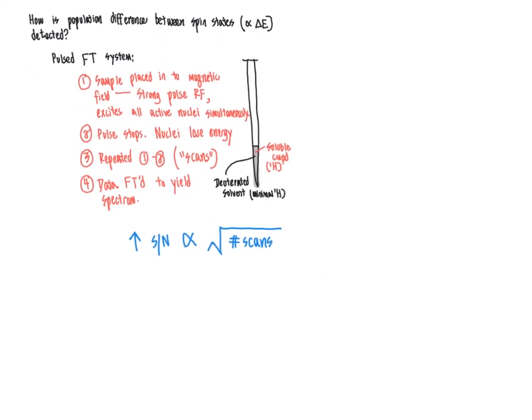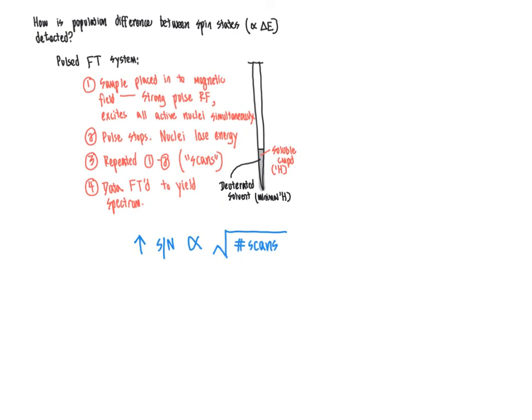Instead, how you can calculate that, if you're thinking about the improvement in signal-to-noise ratio and how many scans you should run if the data are kind of halfway to where they need to be, they're a bit noisy, the signal-to-noise ratio is not great, but you want to make the signals nice and clean and clear.